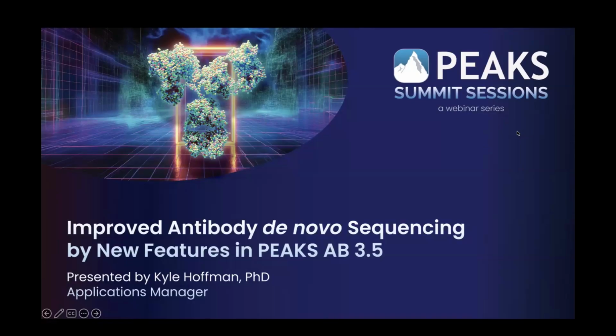Today, Kyle Hoffman, who is our applications manager, is going to go over the improved antibody de novo sequencing and the new features in Peaks AB 3.5. So Kyle, you can kind of take over from here.